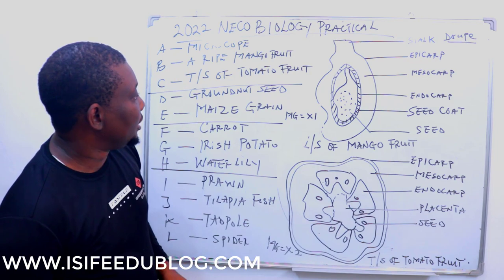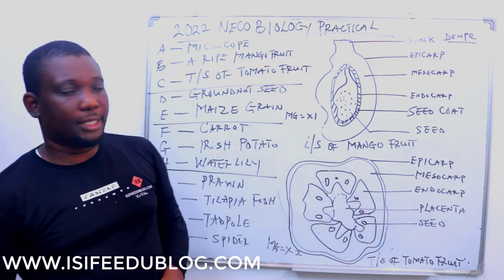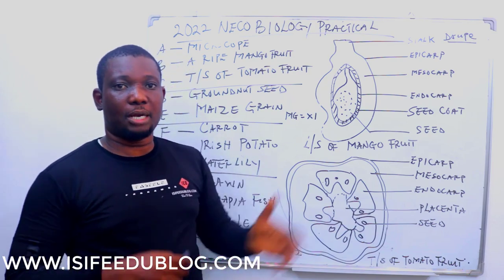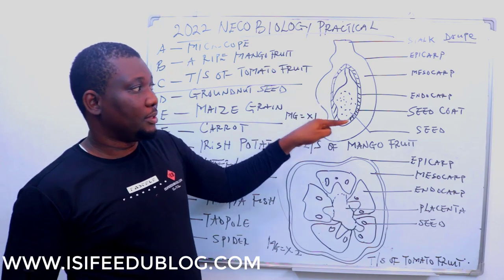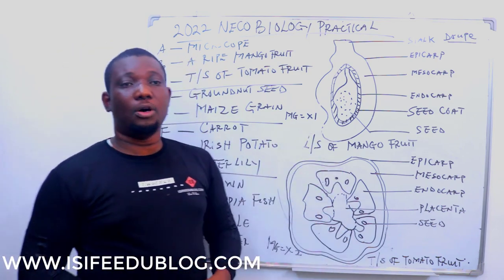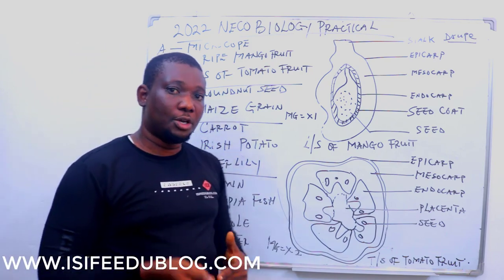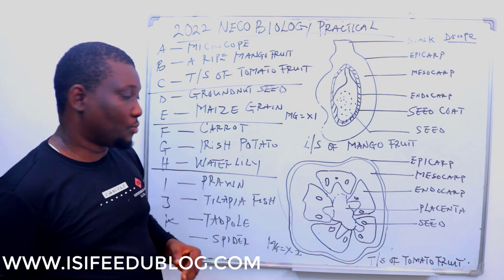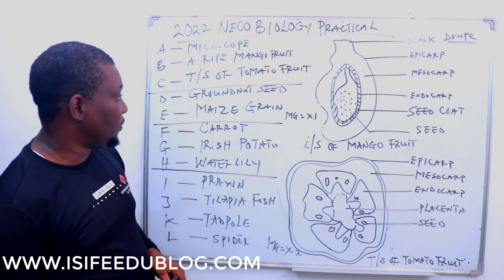That's the food class. Then the mango. In this diagram, you find the magnification. The mango fruit is small and will measure up to 8 cm. So the diagram on paper and the live specimen are the same size. The live mango is the same size as the diagram on paper, so the magnification is times one. I'm not magnifying by enlarging it or reducing it. The size on paper equals the size of the live specimen, so the answer is times one.